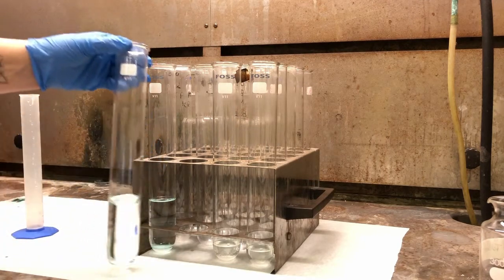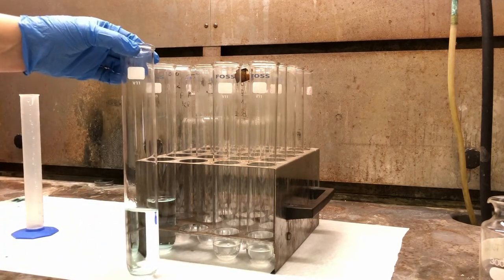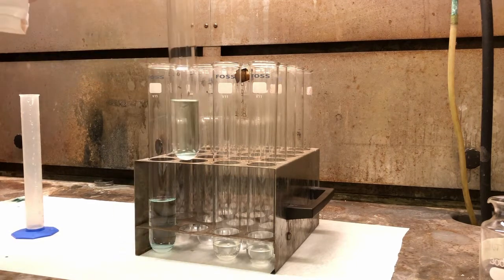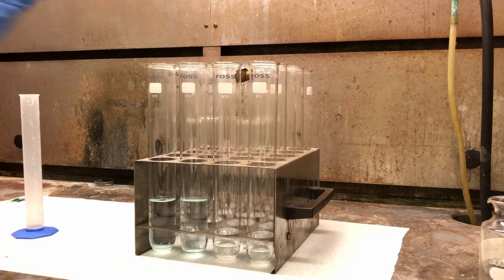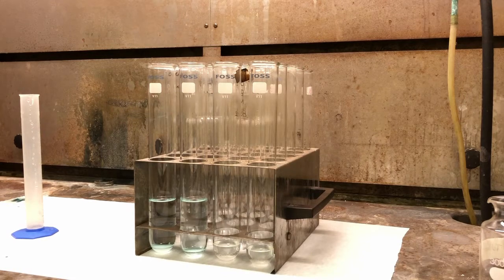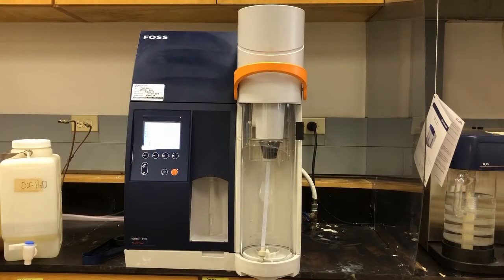And now you can really see that bluish green color. So that's the color we would expect to see. So now that those are all done, we're going to go ahead and start our distillation. So now that our samples are digested and cooled down, we're ready to start the distillation.